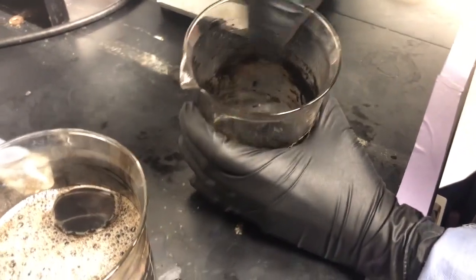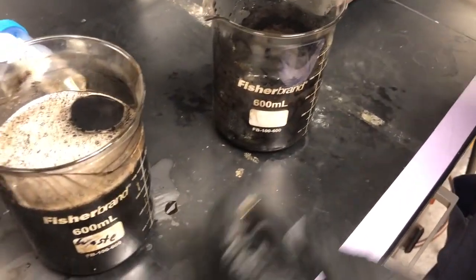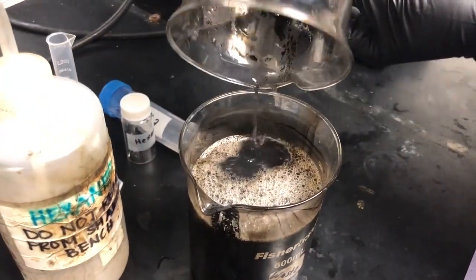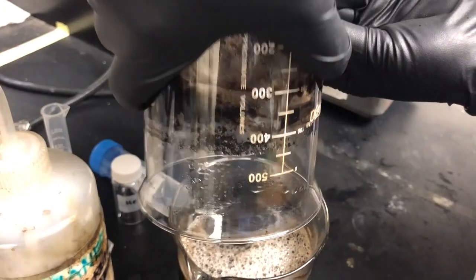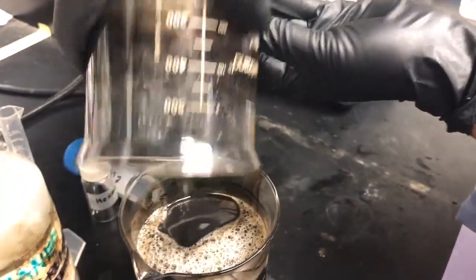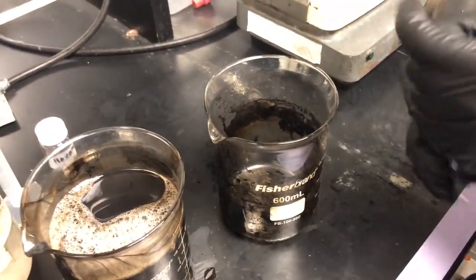Okay. And we're going to use that magnet and again 180 invert the beaker completely vertical. And you can see you can be quite aggressive with it at this point. Perfect. And last one, we'll do one more ethanol wash.